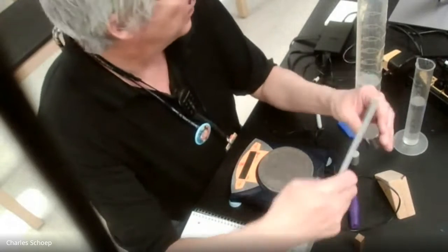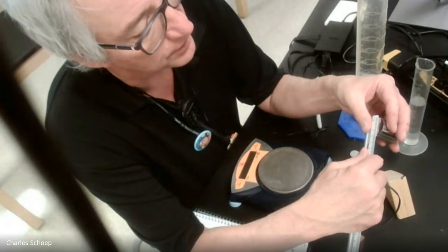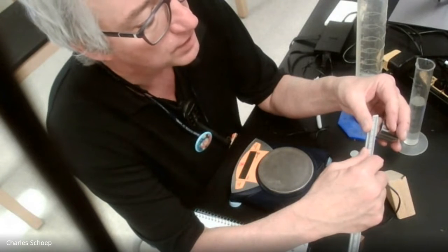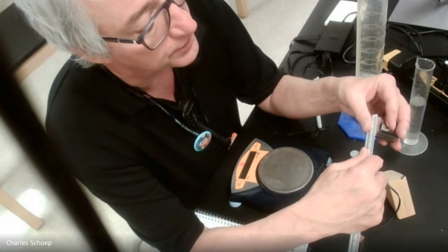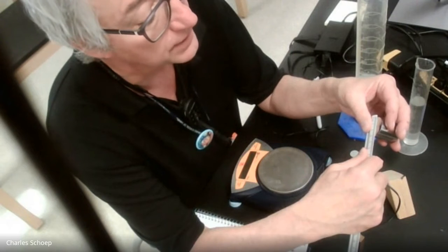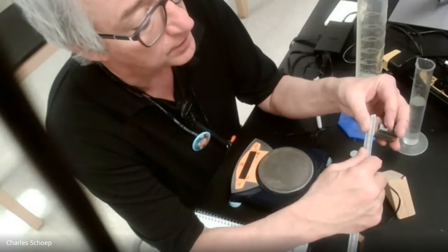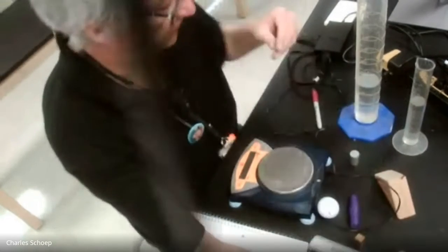So the distance all the way across the cylinder, I'll grab my big cylinder here, is 3.0 centimeters. So that is the diameter. The radius, which is the distance from the center to the outside, is 1/2 the diameter. Since all the way across is 3, my radius is 1.5.